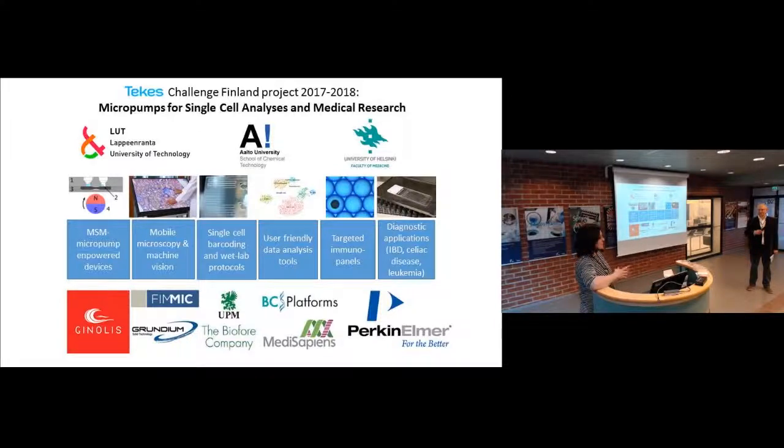Of course, we can make it more high throughput, and capture efficiency can be improved. For example, now in the droplet-based methods, only a few percent of the cells enter the droplet with the bead, and that's where we get the library done. So we can do it for a few thousand cells from each run.